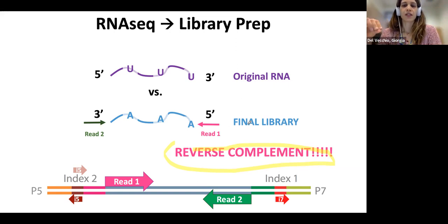And this becomes extremely important, for example, in viruses. So viruses, they have small and compact genome. So the ambiguity there is really extreme. So it's important to have the information about the directionality, okay, about the strand. So performing a directional RNA library prep, it's a plus.